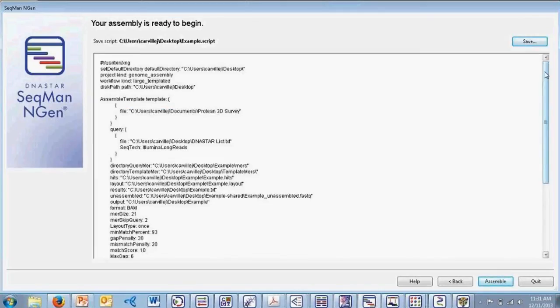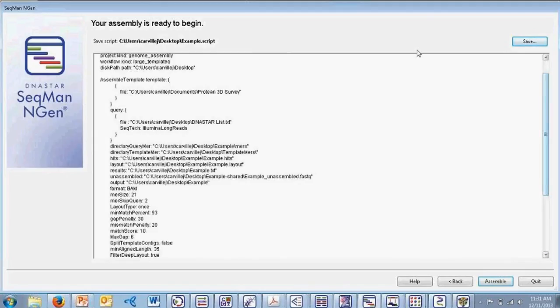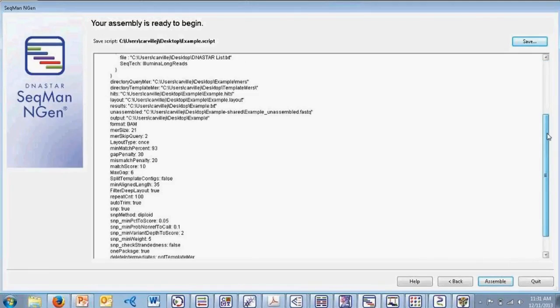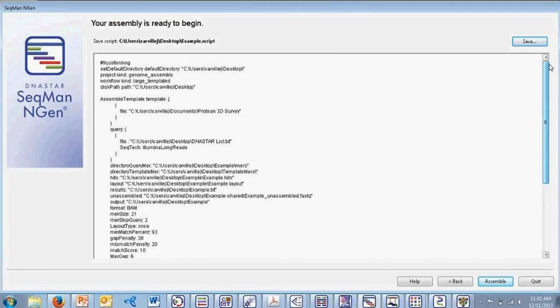Once we've created the script within SeekMan NGen, we have the option to save the script so we can import it to run the assembly again later. If you run into any problems with your assembly, you can send the script to us at DNA Star and we can help troubleshoot any issues. Simply click Assemble and the assembly will run. The assembler is extremely flexible in the range of different workflows that it supports.